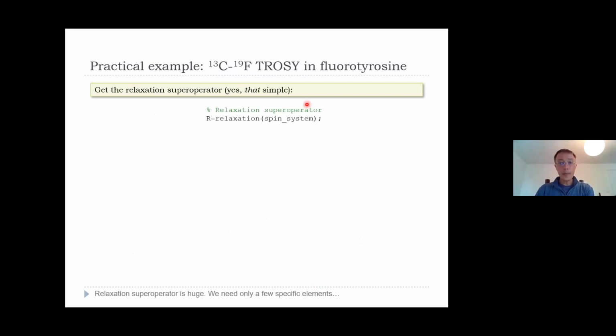Okay, now this is a very beautiful line because this one line contains, I would say, about a dozen papers by now. I started writing when I was in Oxford. You can see the paper about large scale calculations of Redfield relaxation superoperators.